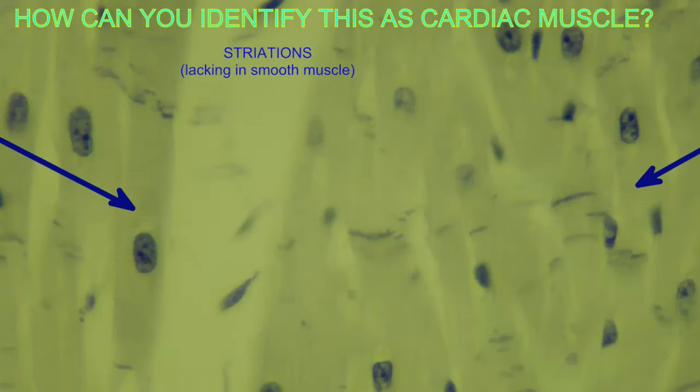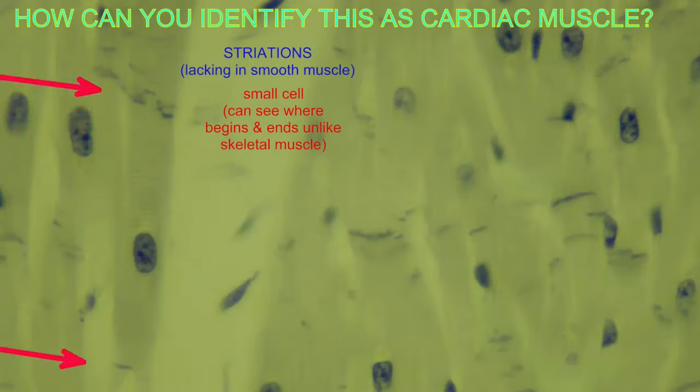Cardiac muscle is one of three types of muscle in the body, and it is only found in the heart. It can be identified as a striated muscle.